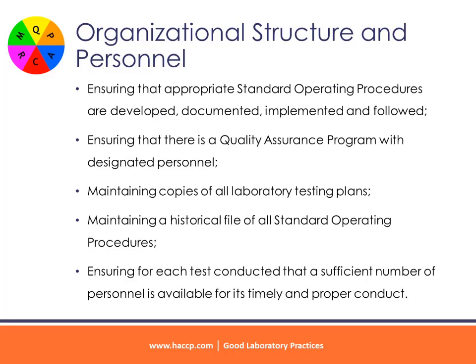Ensuring that appropriate standard operating procedures are developed, documented, implemented and followed. Ensuring that there is a quality assurance program with designated personnel. Maintaining copies of all laboratory testing plans. Maintaining a historical file of all standard operating procedures. Ensuring for each test conducted that a sufficient number of personnel is available for its timely and proper conduct.